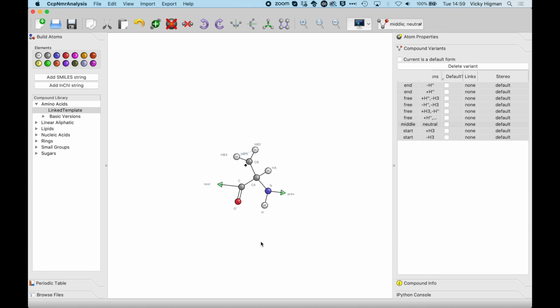Now you can just add to your side chain or take away from it, so I can just click on this atom that selects it. You can remove an atom using this icon up here. I can drag on a new carbon. Bringing two black dots together makes them green and forms a bond. I can also bring on an additional carbon just with the keyboard by typing C. If I've got one carbon already highlighted, it will just add it onto there. If nothing is selected, it will just add it into space.